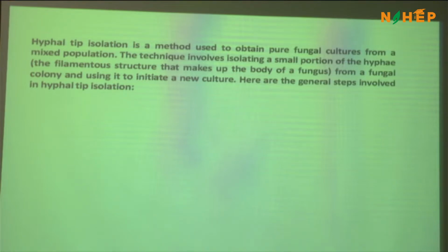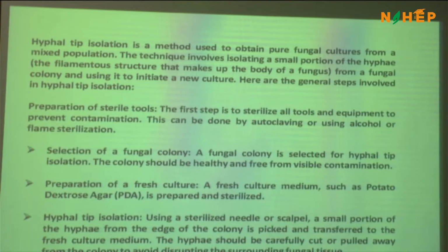Hyphal tip isolation, all right? So use that technique, and of course we cannot give an opportunity for you to practice that. It's quite easy to do. You can do it in your lab. A very cheap method of purifying the fungi, right? So these are some of the steps I wanted to tell you, because fungi are ubiquitous. They are everywhere, right?